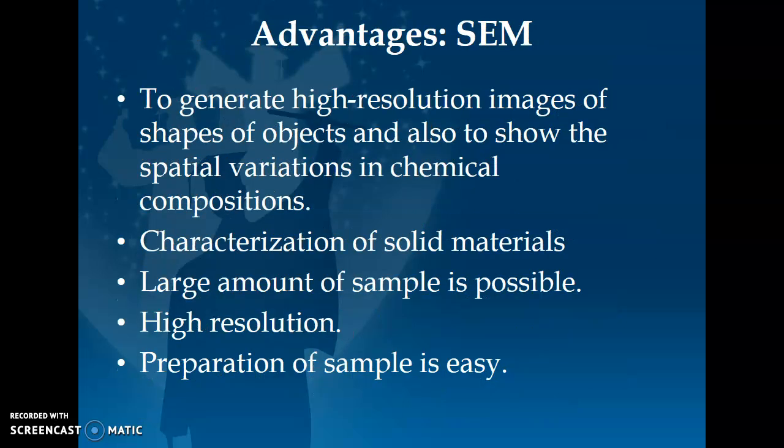Now moving on to the advantages. It generates high resolution images of the shapes of objects and also shows spatial variations in chemical composition.